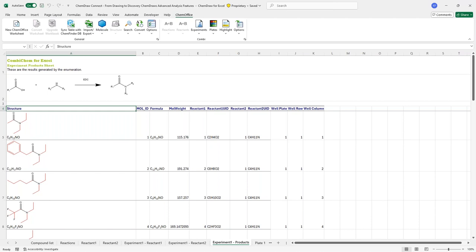That being said, let's quickly summarize all the different options that we looked at today and then transition over, use the last 10-15 minutes to look at the questions that came in and answer most of those.